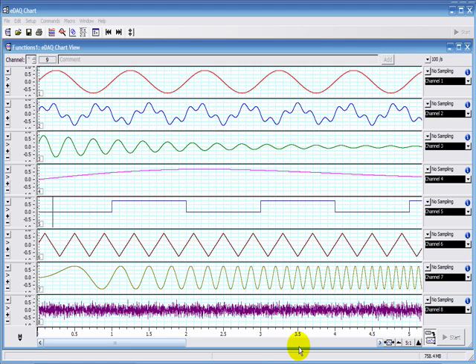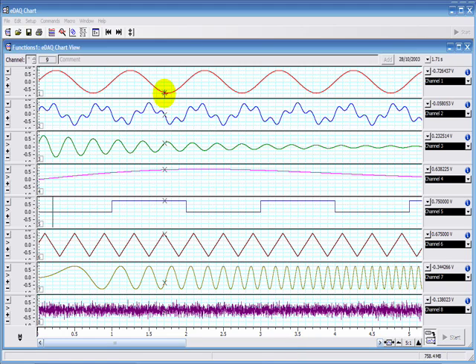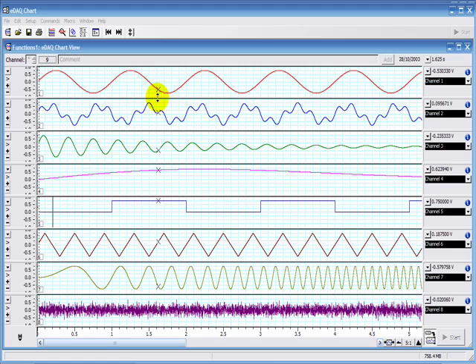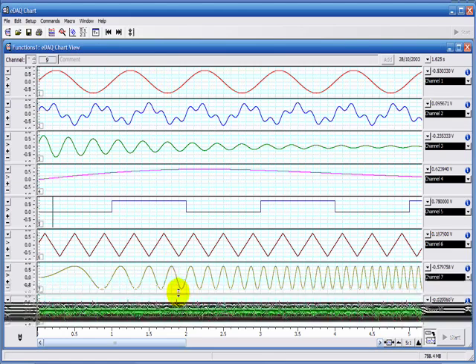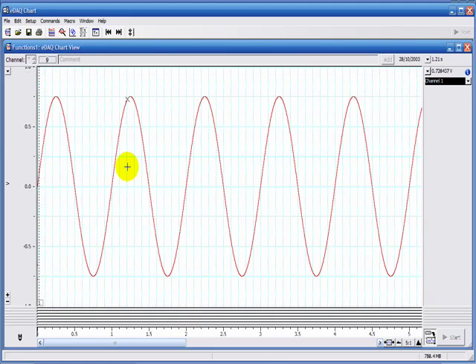The data pad, which can be found in the chart software, the scope software, and the eChem software, lets you do calculations on data you've collected. Here in channel 1, I've collected some data and I'm going to access the data pad by clicking here.